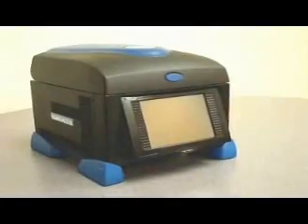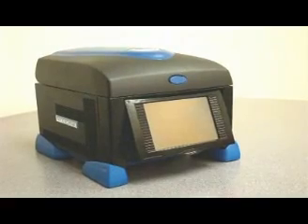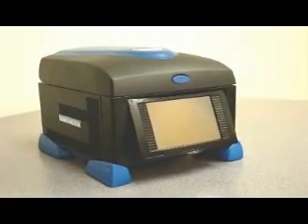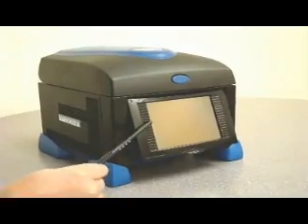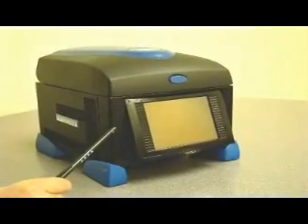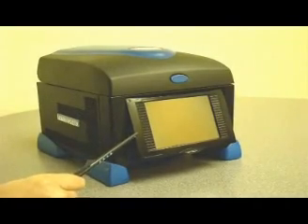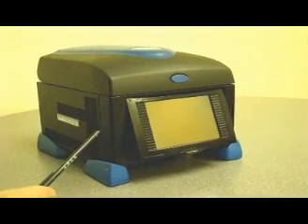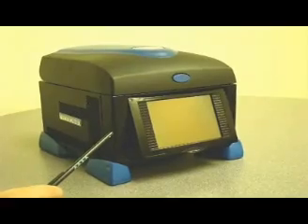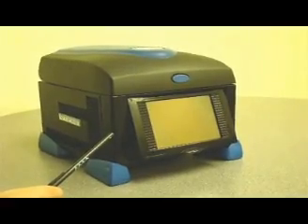All cyclers get hot and cold, but the easy programming of the Amplitronics thermal cycler sets it apart from the competition. The large touch screen makes it easy to navigate through the programming process. Both the A4 and the A6 program identically, adding to the convenience when you buy multiple machines for more capacity.